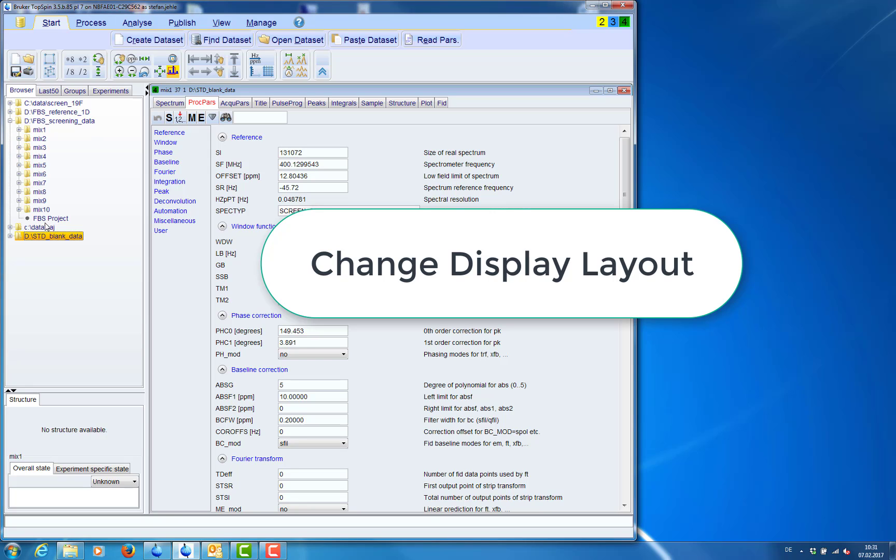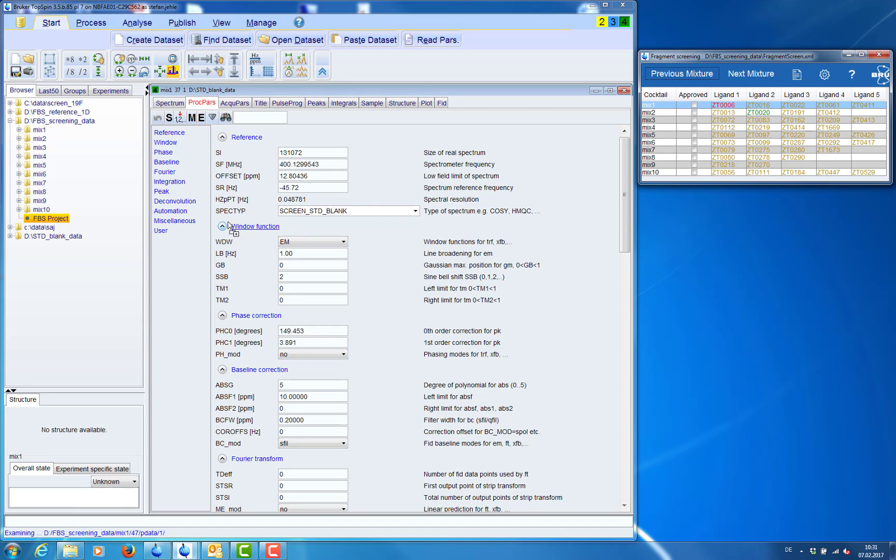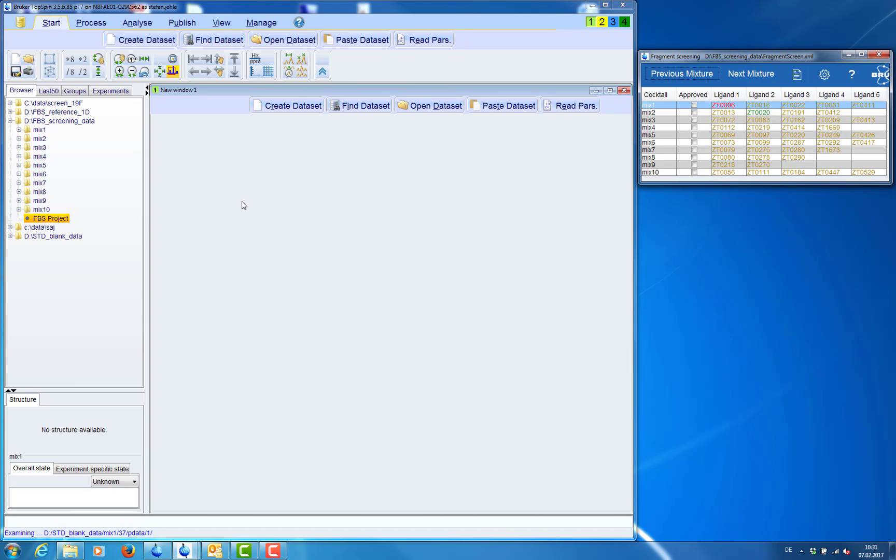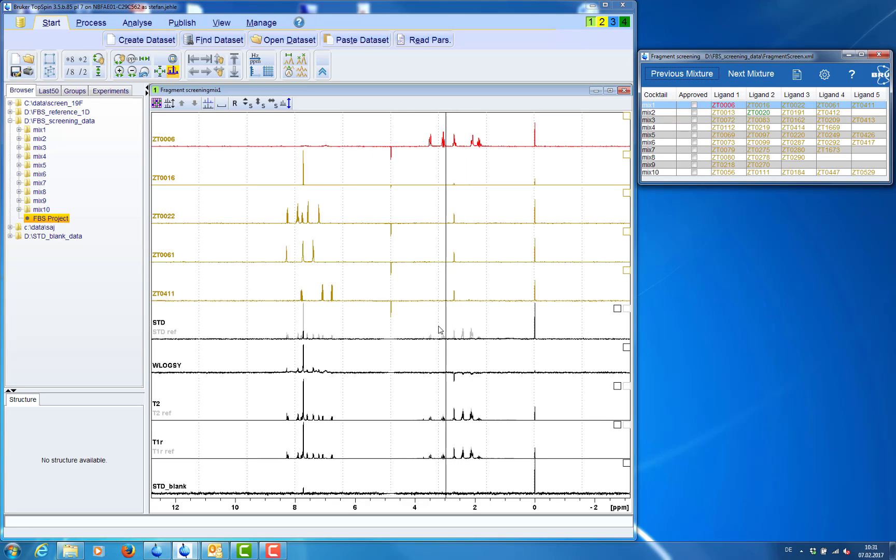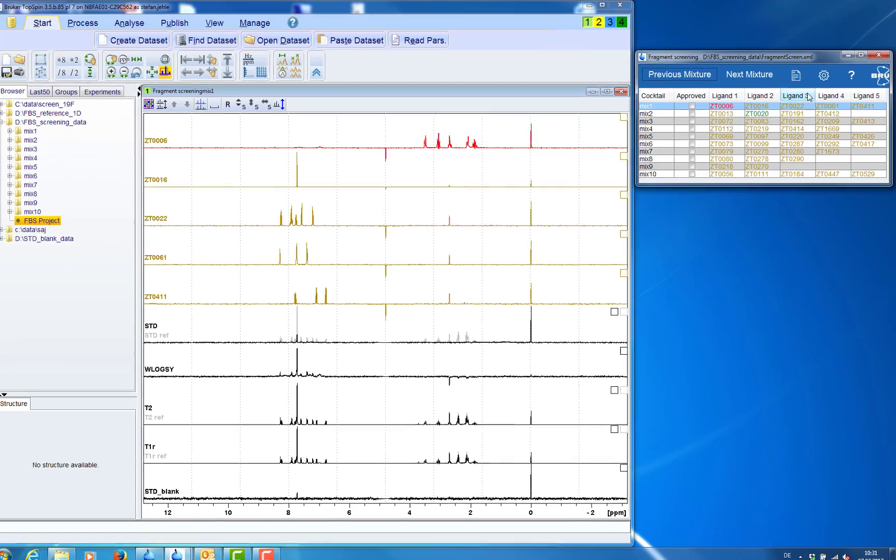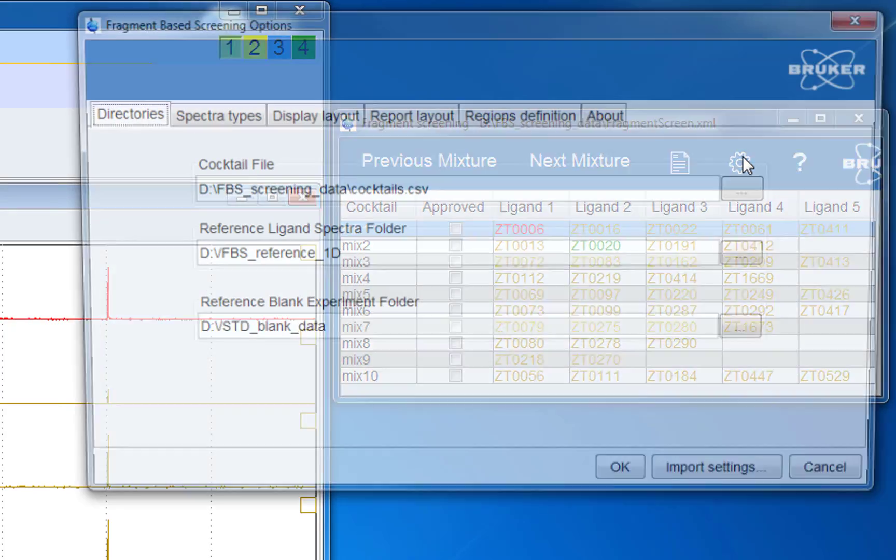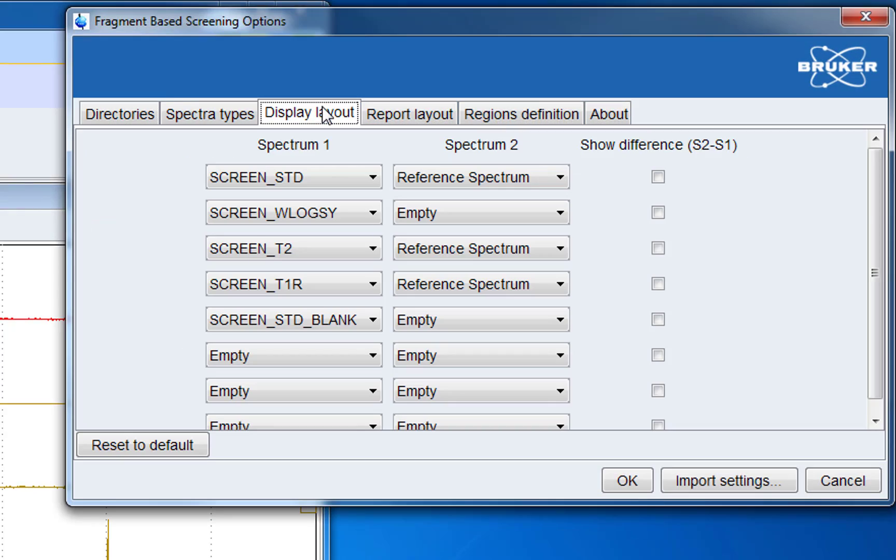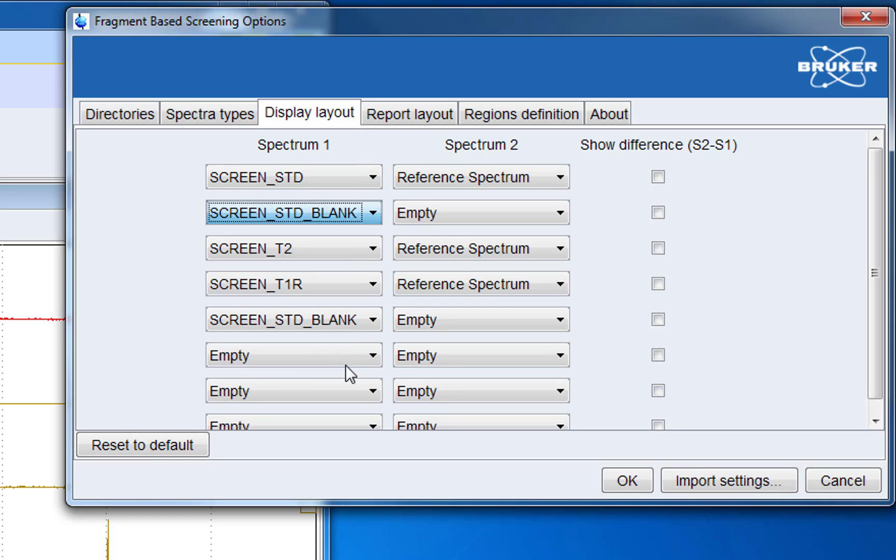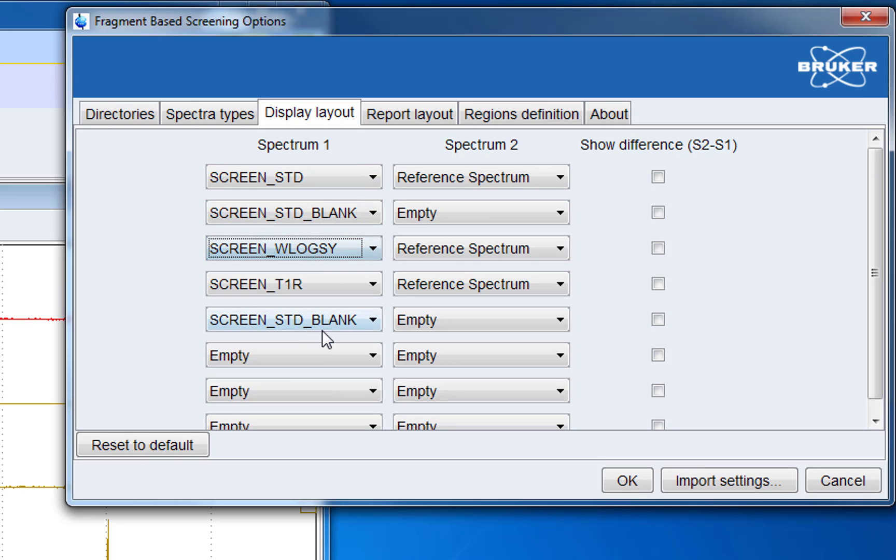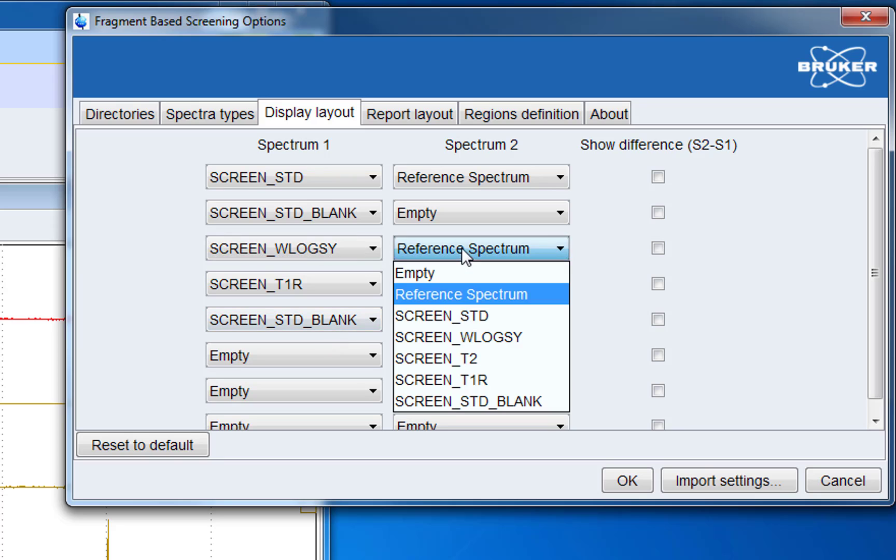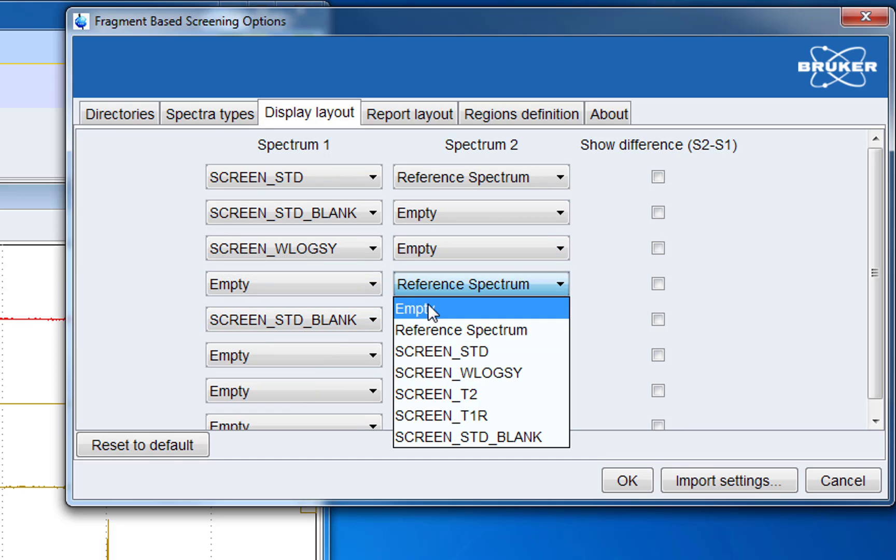Now we want to change the display layout of our screening project. So we start the project. Then we open the configuration menu and go to display layout. Now we want to have the screen std on top. And underneath the blank spectrum this is the screening spectrum of the mixture without the protein.